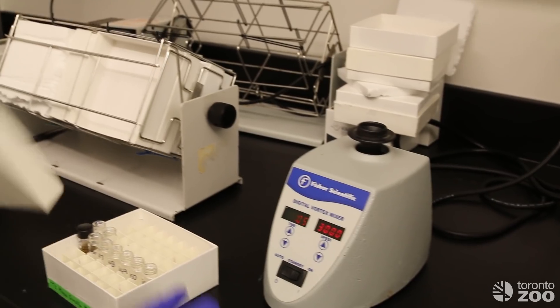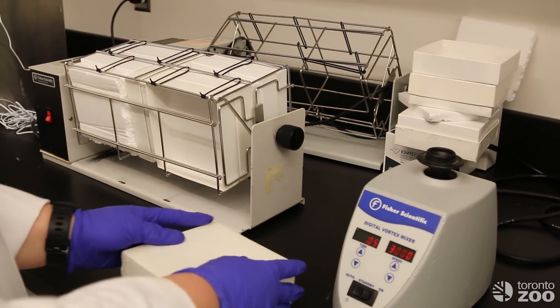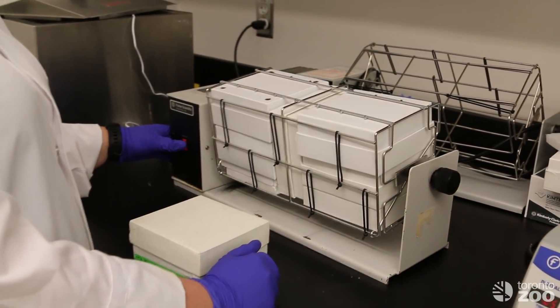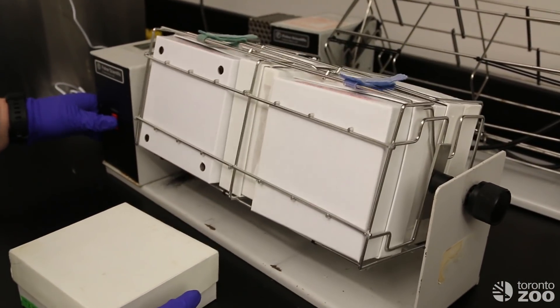Once all the samples are mixed we will put them onto our rotator, which spins them overnight to make sure that all of the hormone is extracted from the feces.